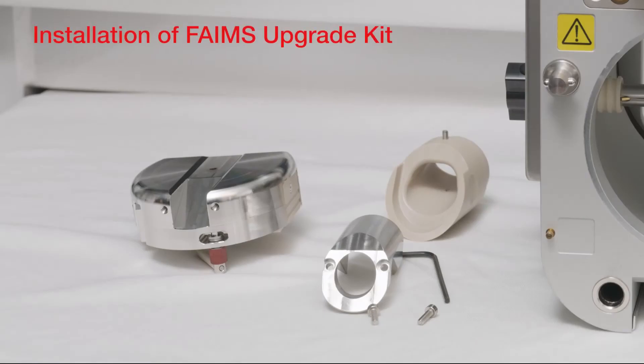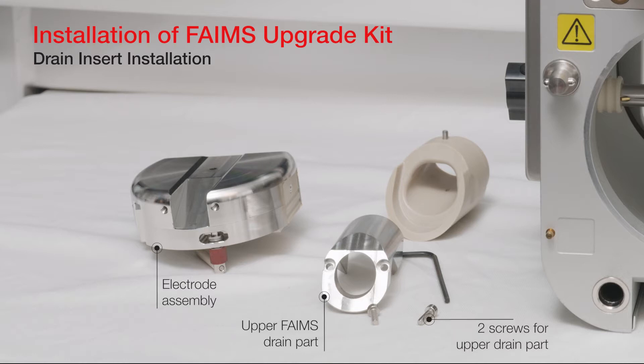Both FAIMS Pro and FAIMS Pro Duo can be used for both low and high flow applications. However, when using the FAIMS Pro interface in high flow applications, an upgrade kit needs to be installed. This kit includes the electrode assembly, the upper FAIMS drain part, two screws to attach the upper drain part, a two-millimeter hex key, and the lower FAIMS drain part.